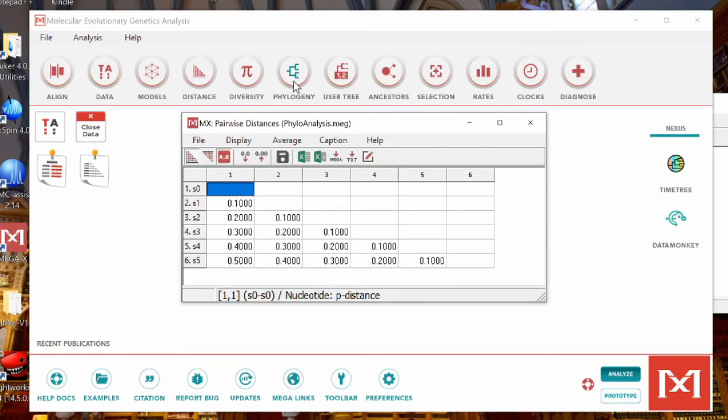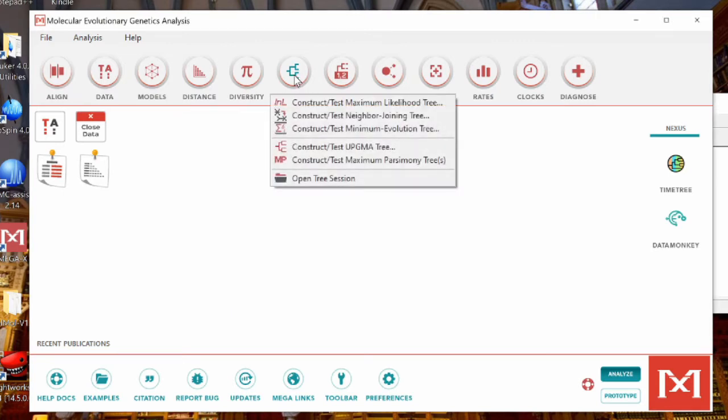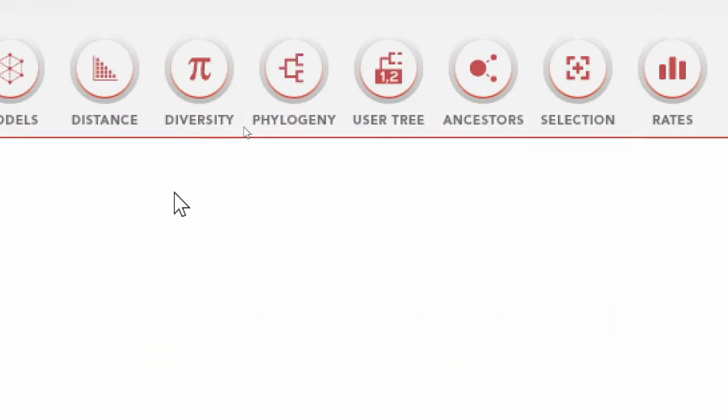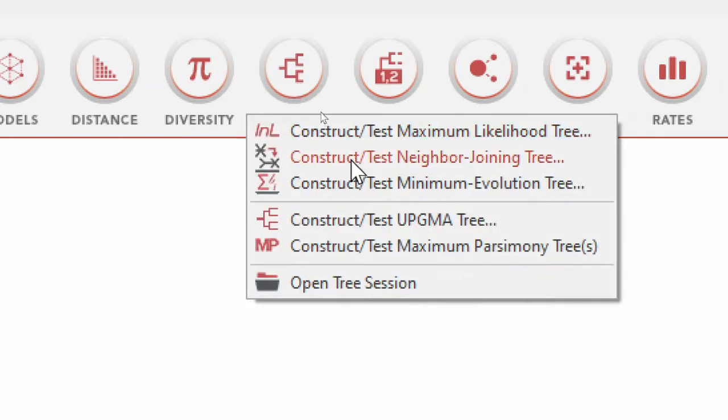All right, so let's build the evolutionary relationships between these test sequences in the form of a phylogeny. Here I can select Phylogeny, and click here. Then in MEGA we have a choice of 5 methods used to reconstruct these phylogenies.